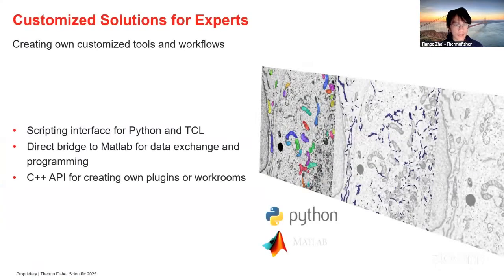This is the last slide for this first part of the description. Maybe there will be two more slides, but essentially here, if you are already an expert in image analysis and you are getting new information and you try to test out new algorithms, this customized solution inside AMIRA is also available to you. So you can quickly try out some of the new algorithms that you learned. Those are expanded functions for expert users.